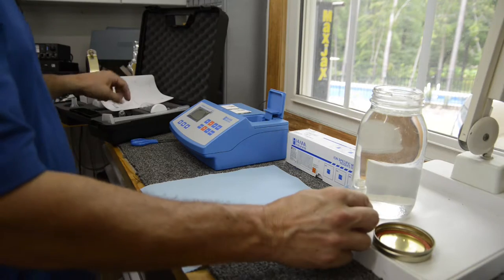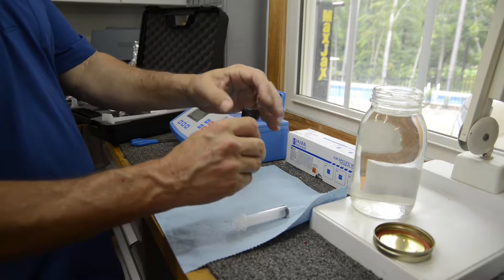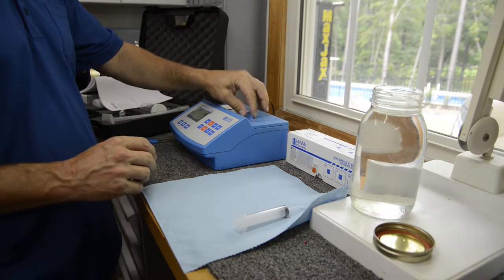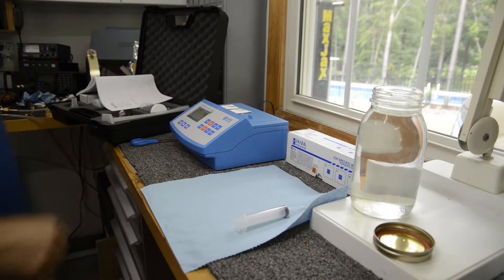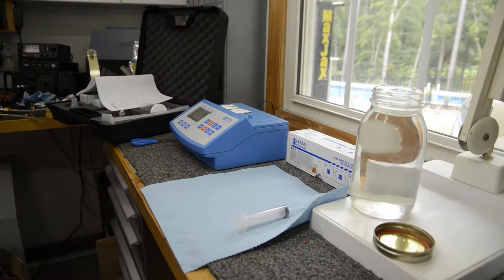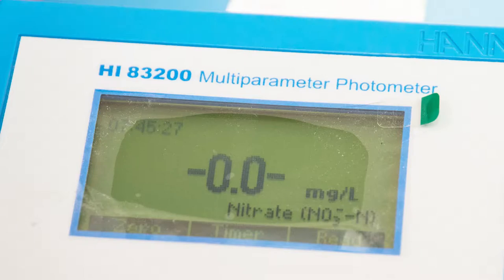That's what this test is going to do. We're going to use a photospectrometer, and when you use this, you have to set a zero. That's the first thing we're going to do - set a zero on our meter so it knows where the starting point is.